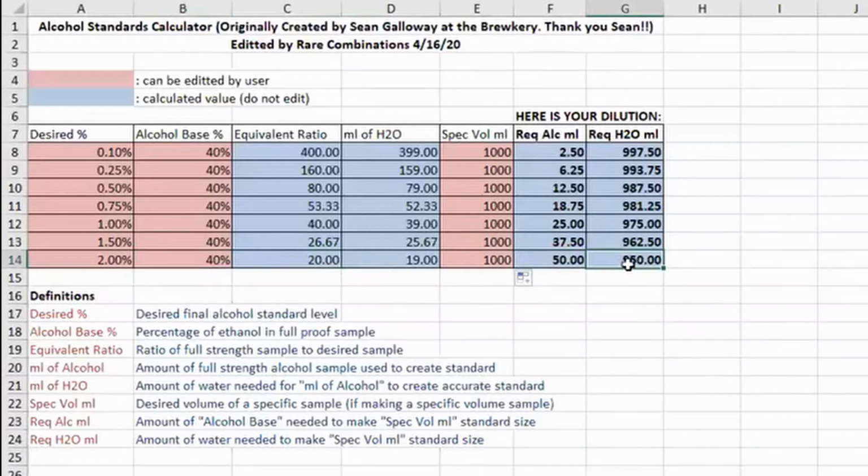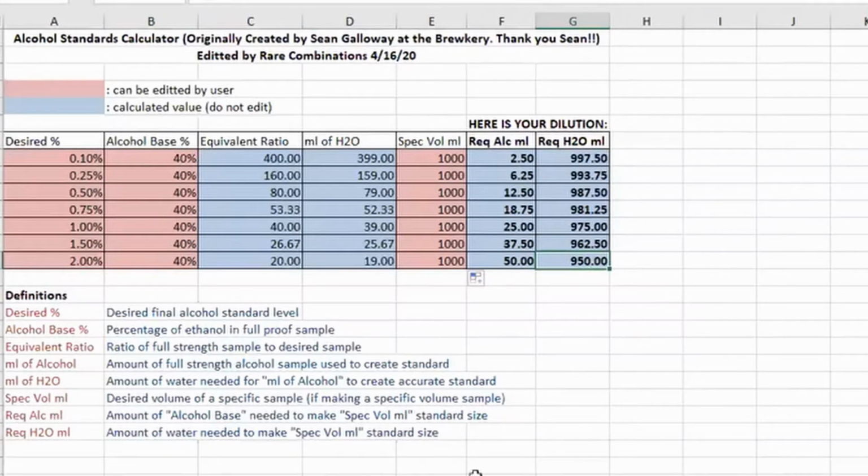That's all of making the calibration solutions. Again, what I would recommend is taking your large volume of calibration solutions and storing them in the refrigerator to recalibrate your detector whenever you need it. I would recommend recalibrating your detector, meaning make an entire new calibration curve, once or twice a month. So that's it for this document.